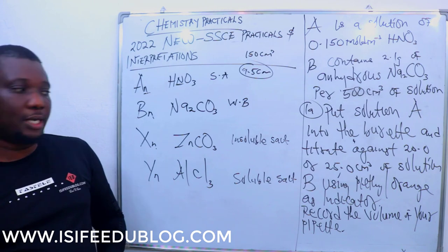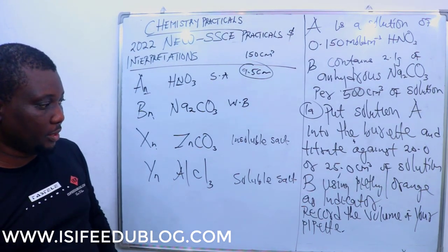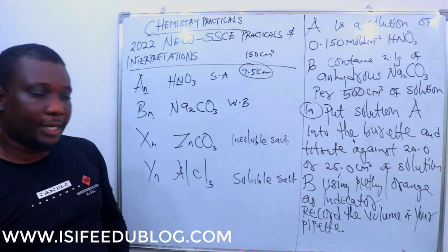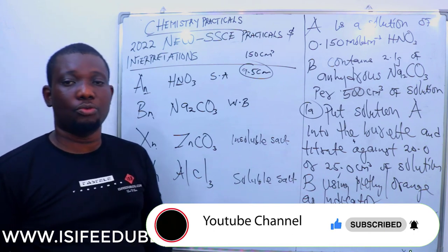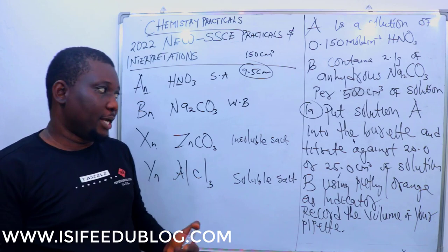You see a lot of things like that on the exam day, but I'm going to show you how to deal with it in this video. So record the volume of your pipettes, carry out the titration. I was just supposed to do that, but I'll just mention it. Carry out the titration several times to obtain consistent titers. And then you will see another question.